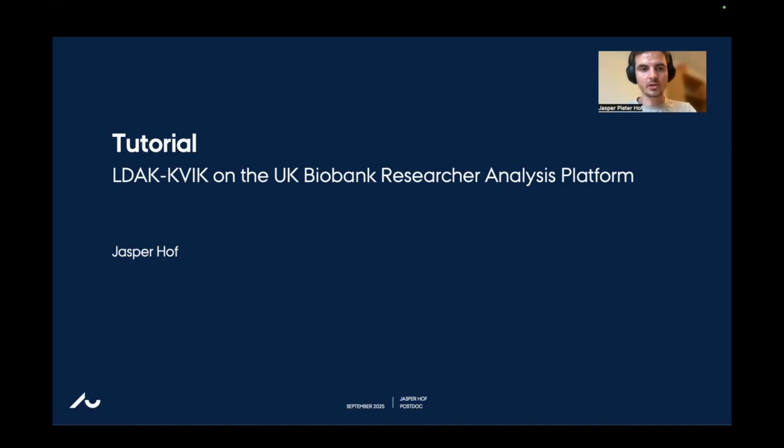In this video I'll show you how to use LDAK-KVIK on the UK Biobank Researcher Analysis platform. In the next slides I'll demonstrate how to set up a connection to the UK Biobank Research Analysis platform, how to install LDAK-KVIK, how to extract some phenotype and genotype data, and then finally how to apply LDAK-KVIK on these data.